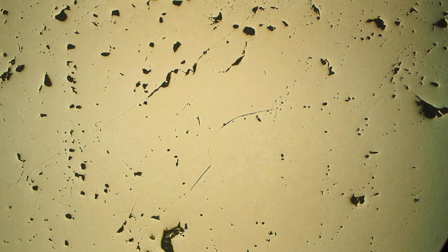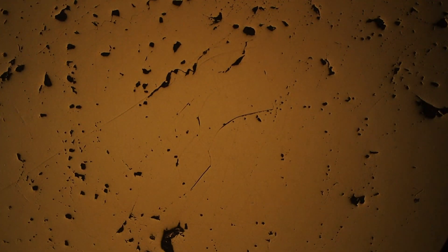If we switch into crossed polars and rotate the stage, we're not seeing very much anisotropy. Sometimes this can be quite distinct and it'll go from gray-blue to yellow-green, but not with our samples.